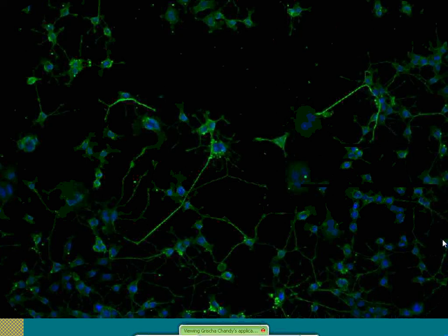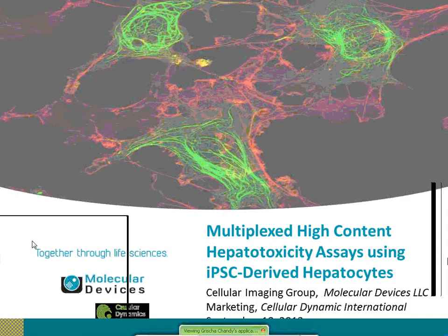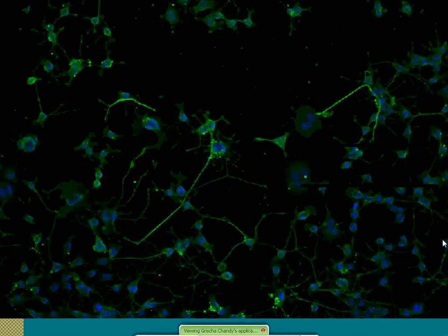Vanessa, this is a question about how you buy and use the cells. Do you buy them completely differentiated? How many cells do you get? Does the customer need to keep them, and can they keep them and grow them? And on that same note about the workflow of using the cells, what happens when they go through multiple rounds of cryopreservation?